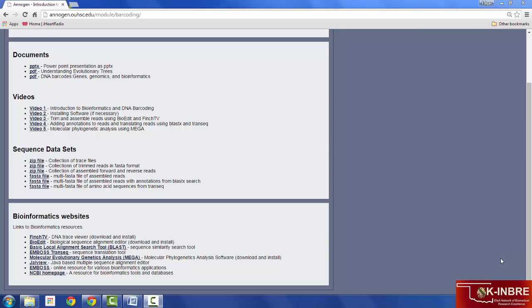An important step in DNA barcoding is to try to identify the species or its closest relative associated with the cytochrome C oxidase fragment that was extracted and sequenced from your specimen. A simple way to do this is to perform what's called a sequence similarity search against a protein sequence database, and this search will identify matches to the sequences within your data set.